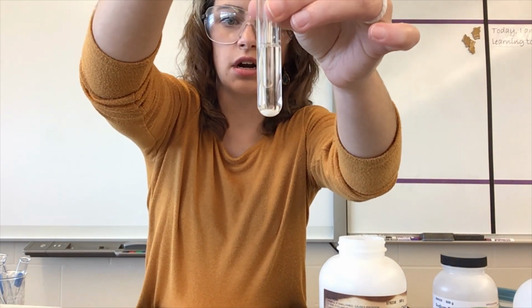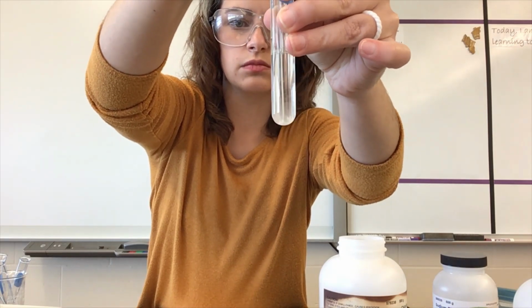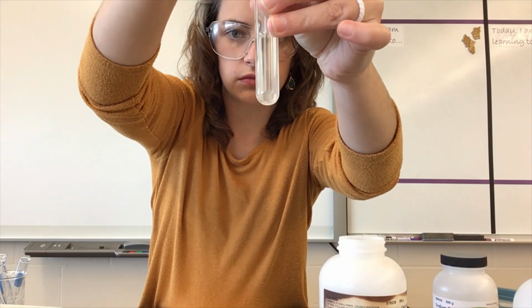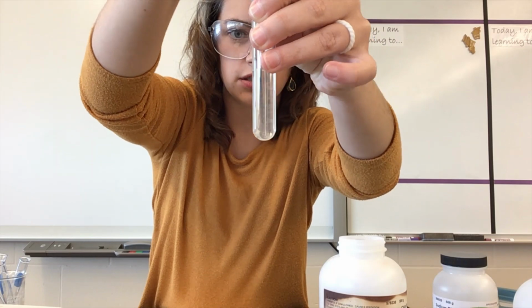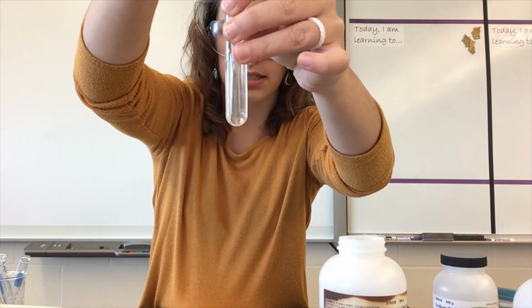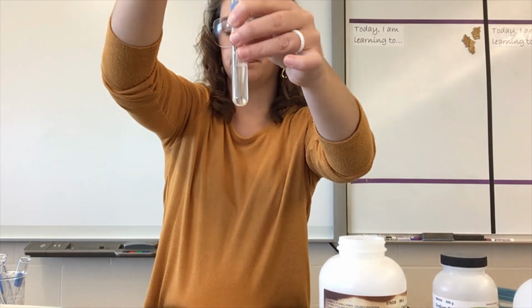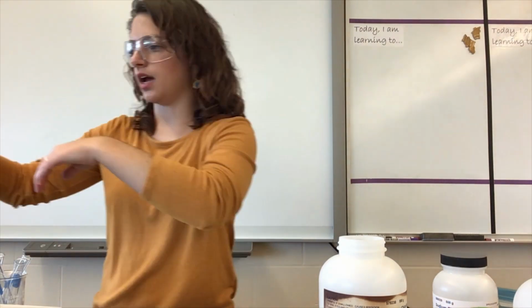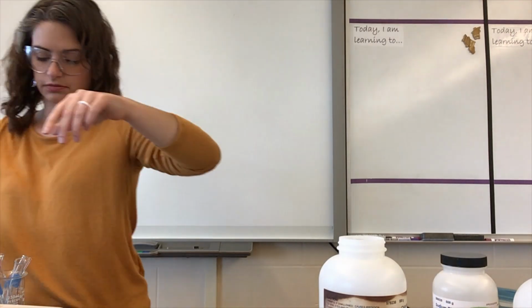You can already see it starting to dissolve a little bit. And it is definitely dissolving. So there is no solid left at the bottom. So for solubility, I'm going to say yes, it is most definitely soluble in water. Okay, I'm going to set my test tube off to the side, give my stir rod a rinse.